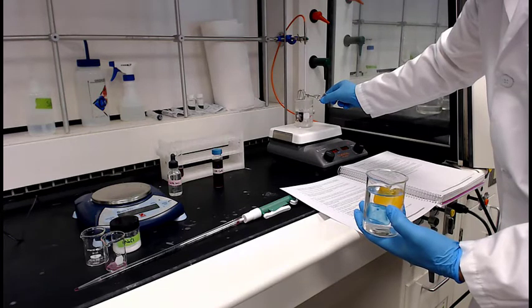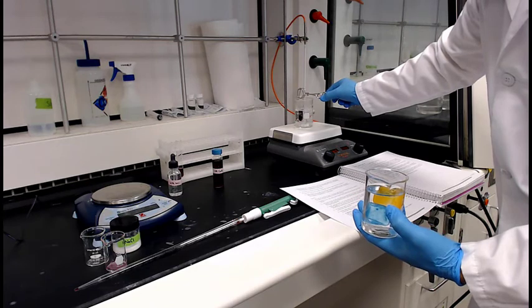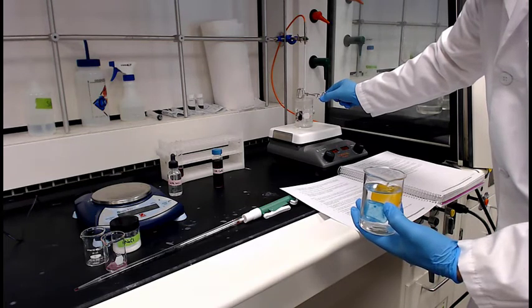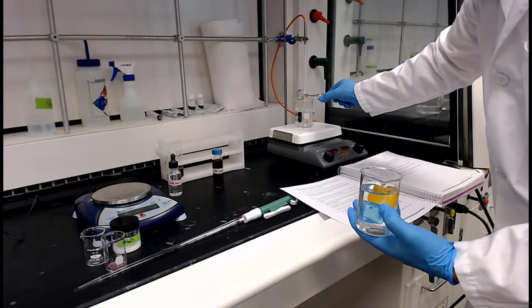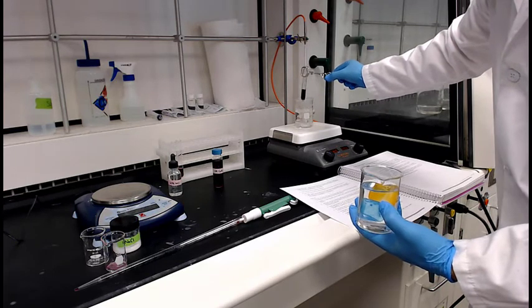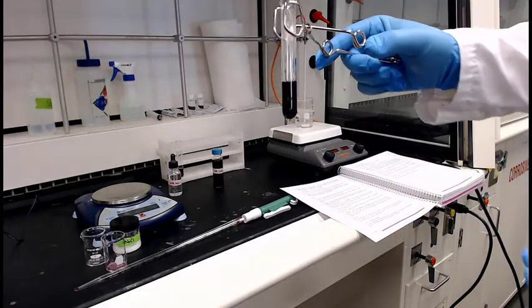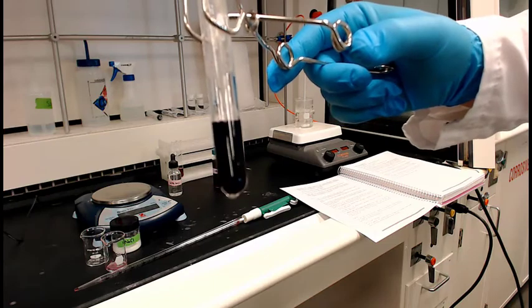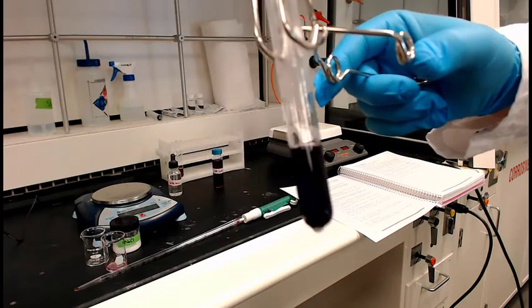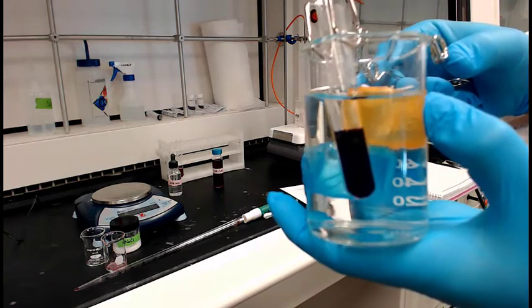So this one was a little bit more on the border. So now when you go between the hot and cold, it really pushes hard to the right and hard to the left. Get it hot. Ooh, look at that. That is beautiful. Man, I wish you'd set that over that white background. That would help us. Thank you. That is just as dark as it can be.